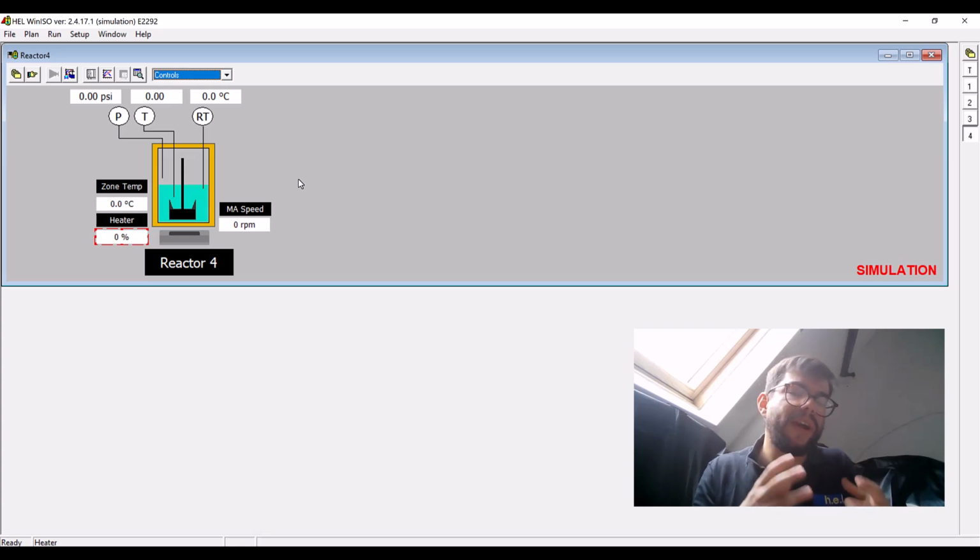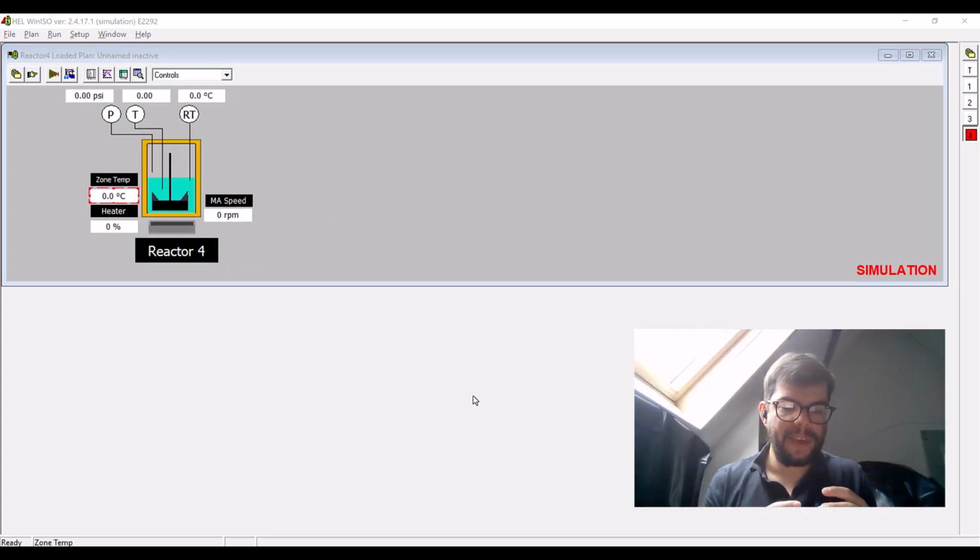Actually, what we pride ourselves on here at H.E.L is that we are very good at providing optimized solutions for customers. So what we can do is create a plan. Plans are the programmed recipes that you can input into WinISO in order to optimize your process.